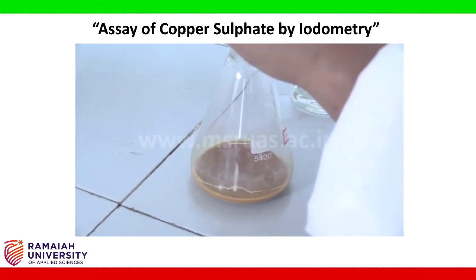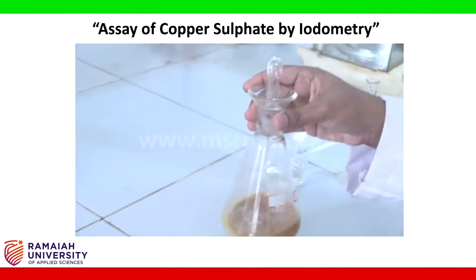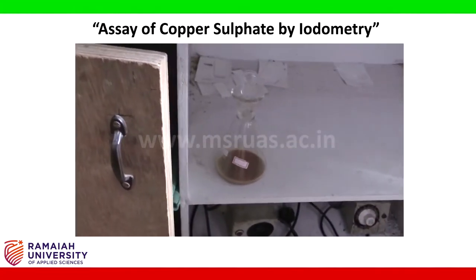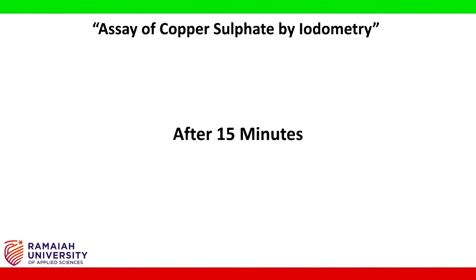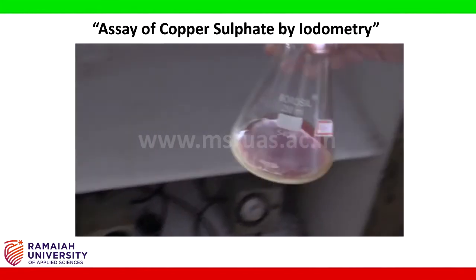After transferring, close the lid, then keep in the dark with occasional stirring for 15 minutes. After the completion of 15 minutes, take the iodine flask from dark.